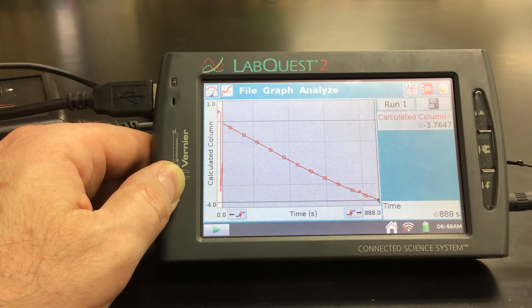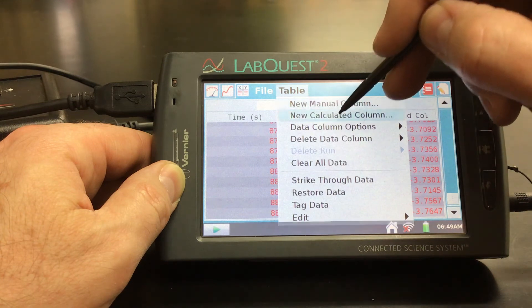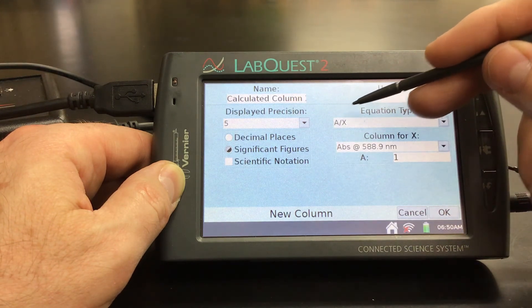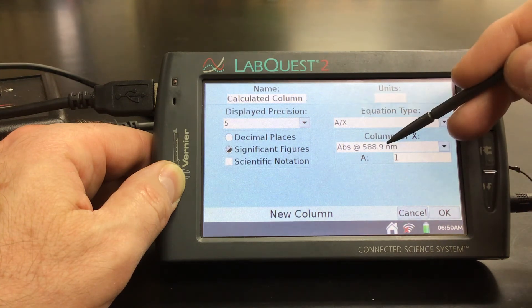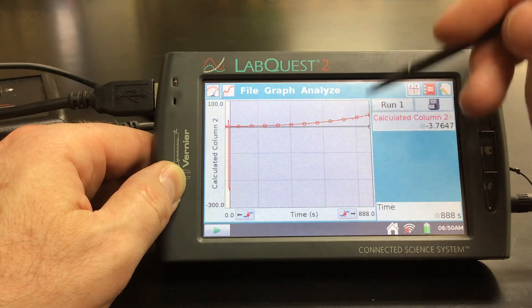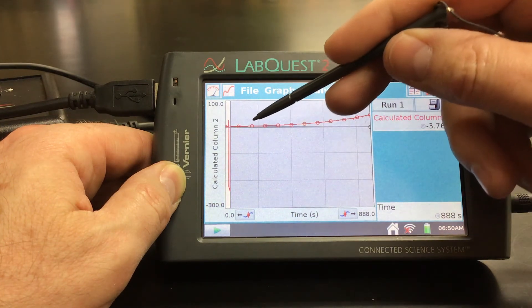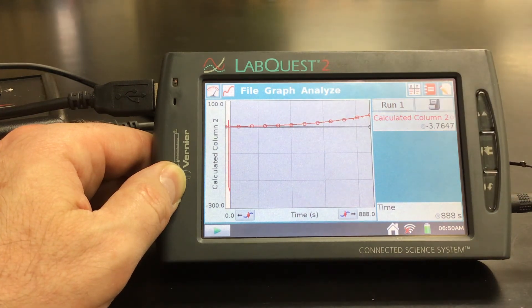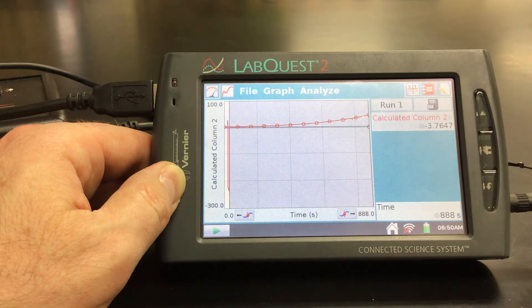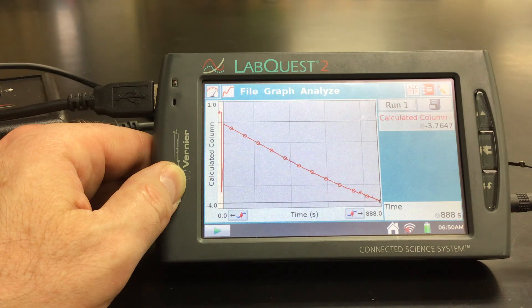So I'm thinking this is first order. We can also check one over the absorbance. We go back to our table and make a new calculated column. This time our equation is going to be A over X — whatever A means — over X, which is the absorbance. So one over X, checking to see if it's second order. We hit OK. Even though the data set is a little bit skewed, this second calculated column — one over the concentration or one over absorbance — we see it kind of curves up. So I think definitely this is a first order reaction and the data is super conclusive. If we go back and switch to the first calculated column, which was the natural log, we can see that it is super linear.